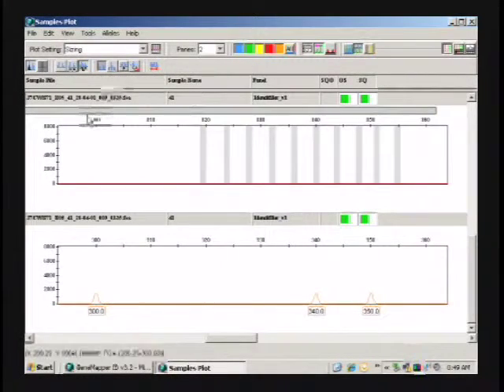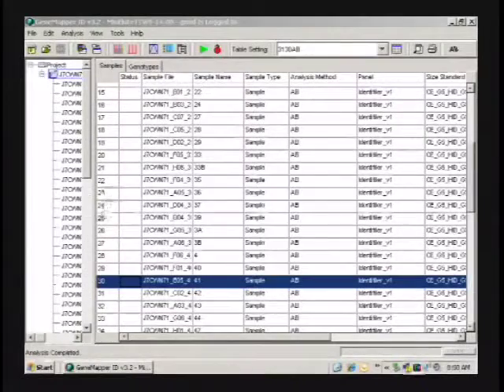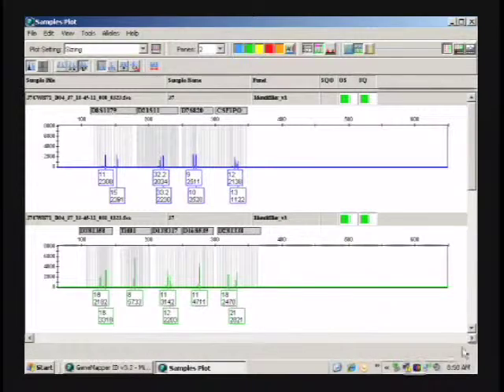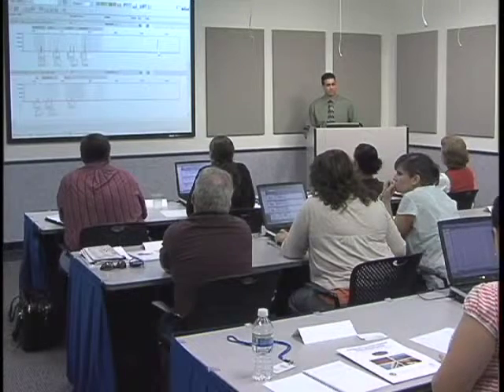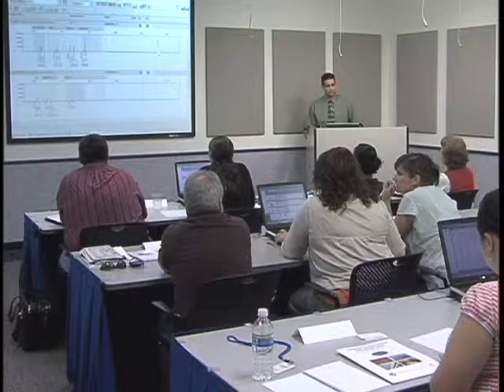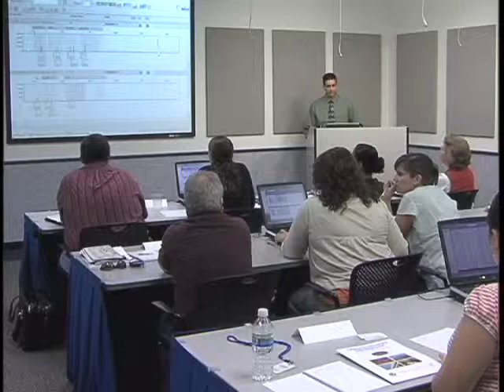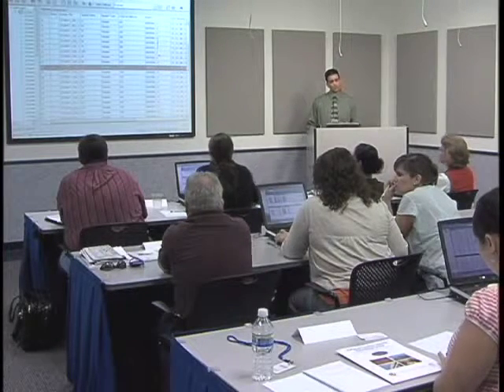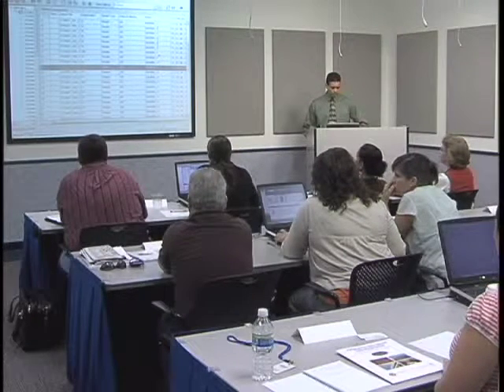I wonder if that is somehow a byproduct of the fact that we didn't get all the washing done. I just was able to take a quick glance at the samples today, but it's not happening in anybody else's. I'm just curious because that's something that I didn't see. I'm not seeing anybody else's stuff going off ladder on those alleles, those markers.